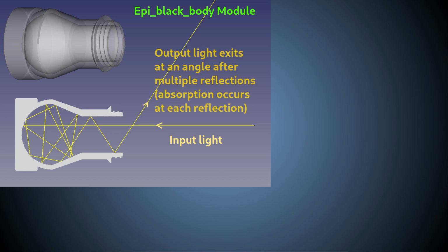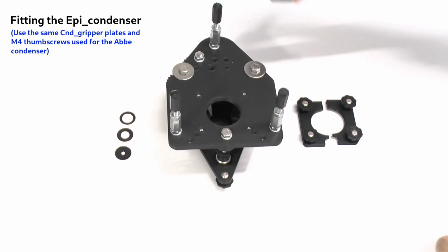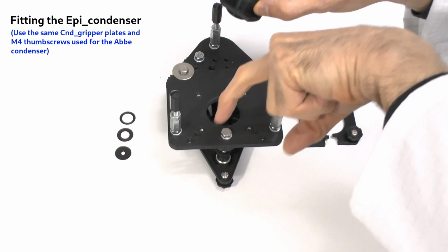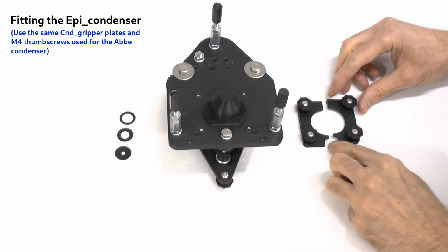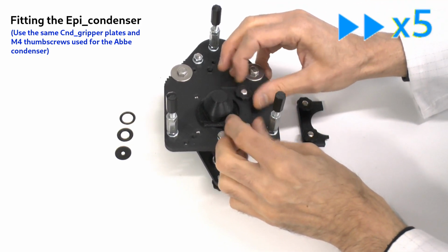When epi-illuminating a transparent specimen, such as with epi-fluorescence, it is also desirable to minimize any back reflections from the illuminating light that passes through the specimen. For that reason, a special light sink epi-condenser was designed. This is only called a condenser because it fits into the same position as the true Abbe condenser and uses the same centration adjustment mechanism, but it does not contain any lenses.